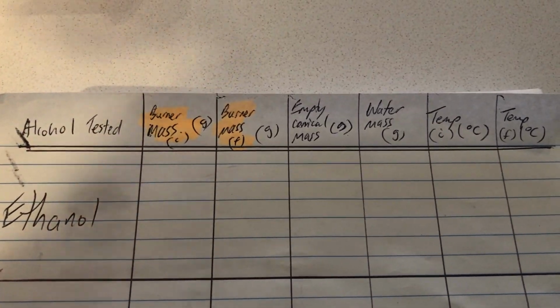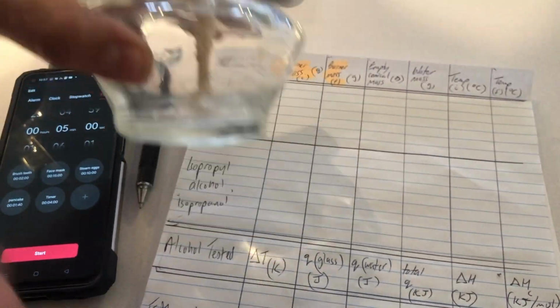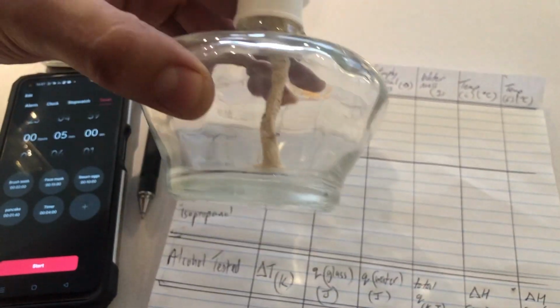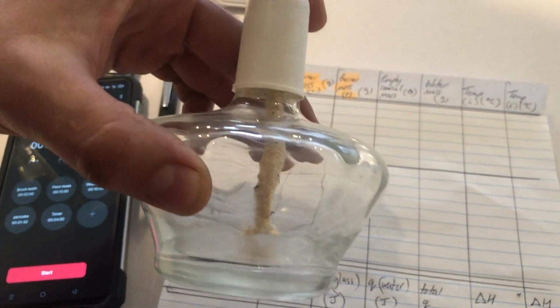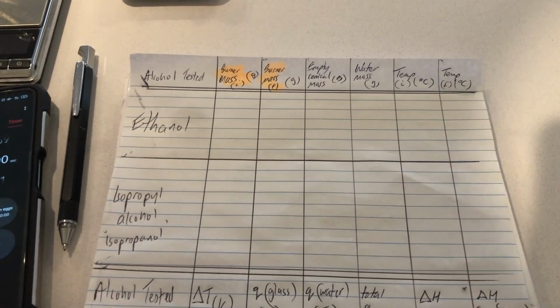At school, the burners look more like this, and I decided not to use this one and go with some steam burners that are used for a steam engine. Mainly because, well, enthalpy is all about the energy that you can use to do work, like run an engine, but I also want my burners to be the same, and I've only got one of those. So we're going to use two of those small burners.